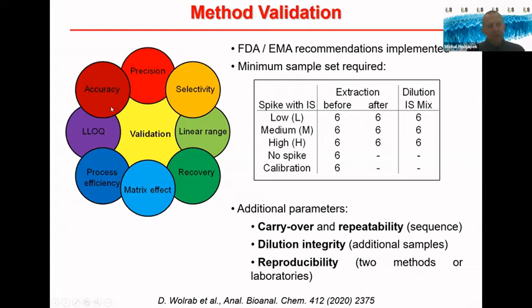But just trust me, if you do all these things, then you are absolutely confident that you don't have any bias in your methodology and you may use it for high throughput quantitation. It happened to us a couple of times that we detected an unexpected problem for some internal standard or for some lipid class, and then we repaired and modified the methodology.